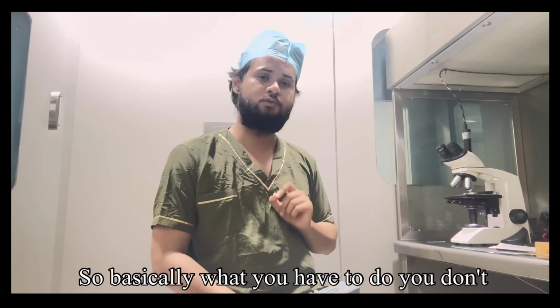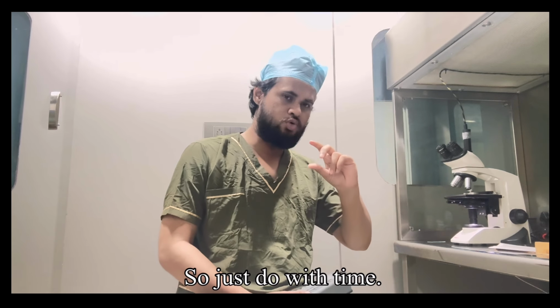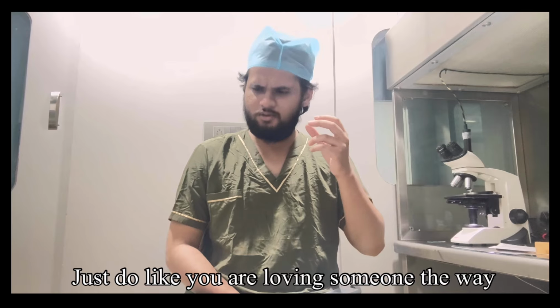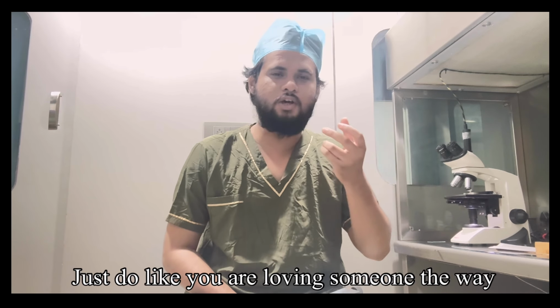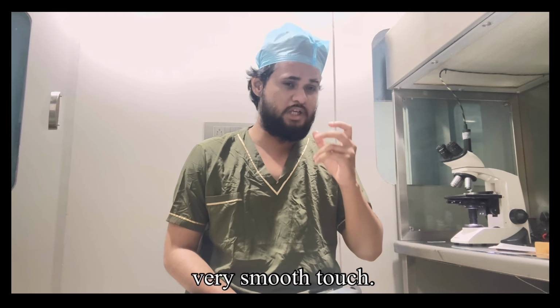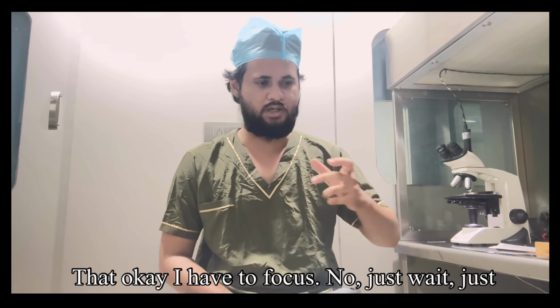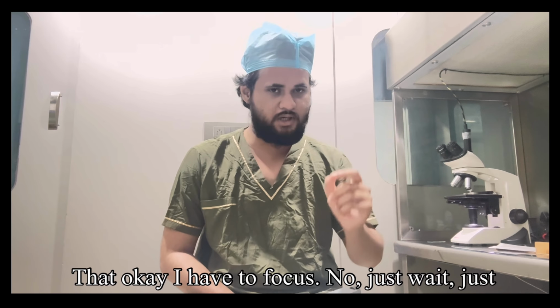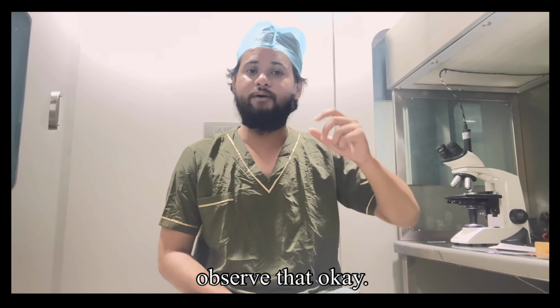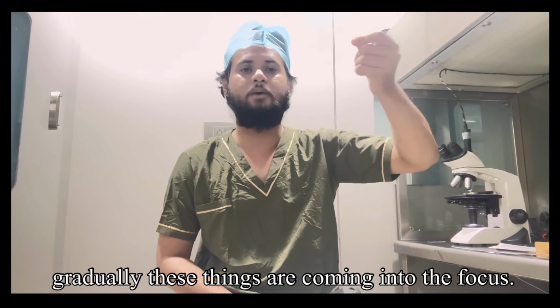So you have to be careful. Just do it with fine hands, like you are loving someone, with a very gentle, smooth touch. You don't need to be rough or fast. Just wait and observe, and gradually things will come into focus.